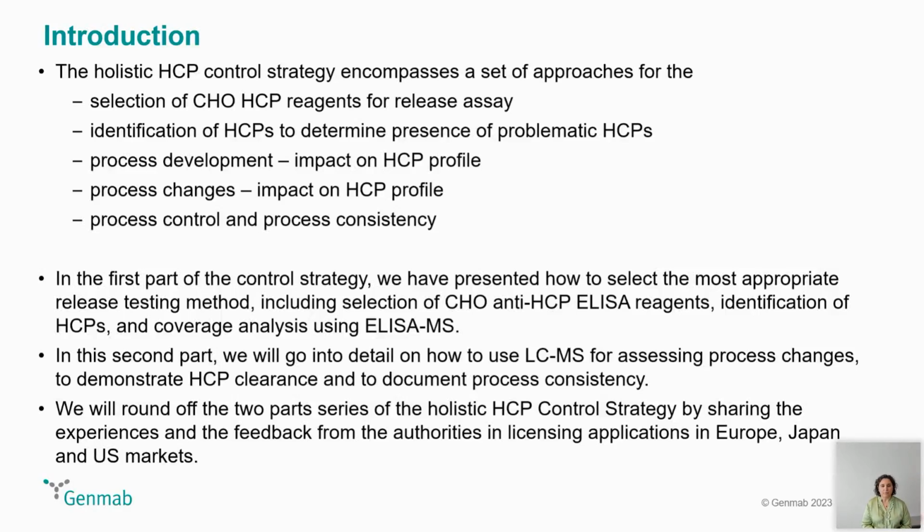In this part, I will focus on how to use LC-MS for assessing process changes and demonstrate HCP clearance and document process consistency. I will round out my presentation giving you insights and sharing the experiences and feedback from the authorities in licensing applications in Europe, Japan, and US markets.